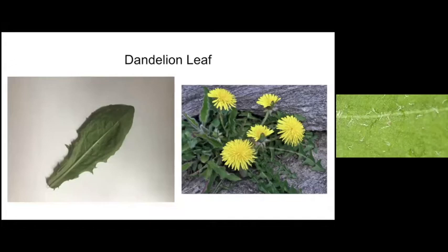That's definitely something. Nippon would like to show you a microscope. Oh, wow. Love to see your microscope. Yeah, we saw Jacob and Jerome's microscope. I would love to see yours, Nippon, too. You want to show your screen? Yeah, I think. There we go.